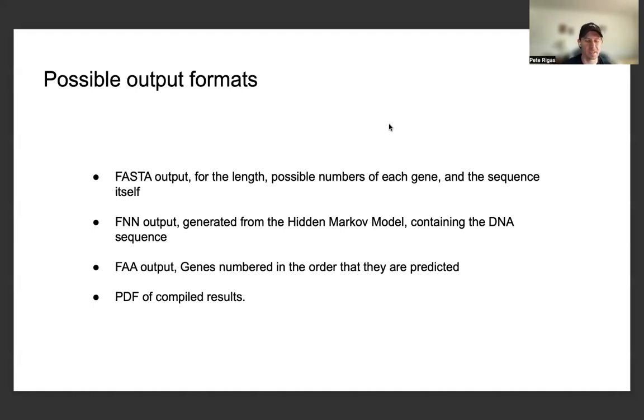So we're going to discuss how, depending on the FASTA output, which includes different DNA sequences that can be input into GeneMarkS, what would be the type of predictions and how would the predictions for additional genes from the specific type of genome that we discussed relate to characteristics of the genes' genetic sequences themselves that are used as input for the unsupervised model.